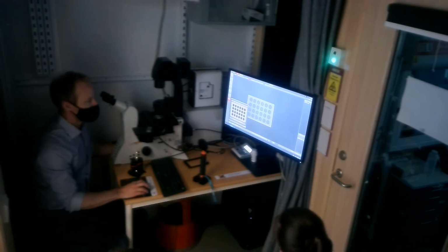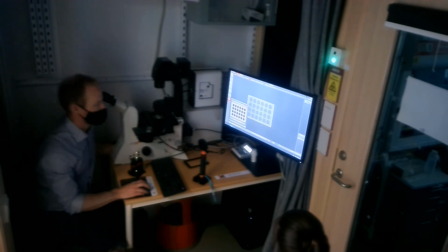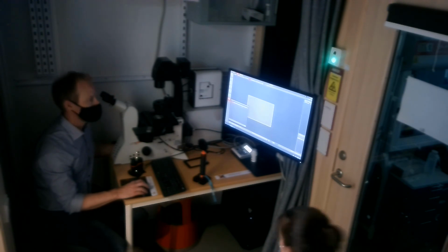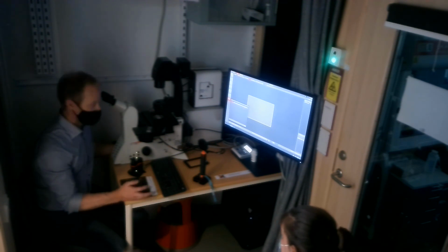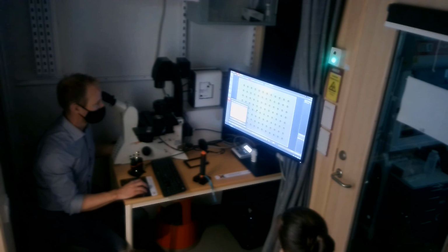Again, also here you have the little eye that will walk through all of these things if there is something that you forgot or so. But yes, for well plates, I find this quite useful, especially for setting up. So you get a little bit of semi-automatic workflow to quickly set things up. And of course, if you are working with a 96 well plate, oh no, it's a different one.